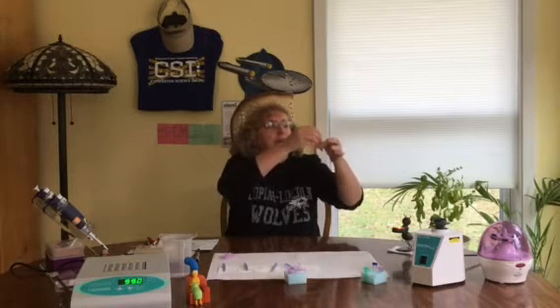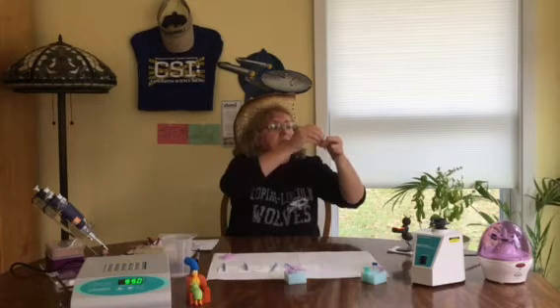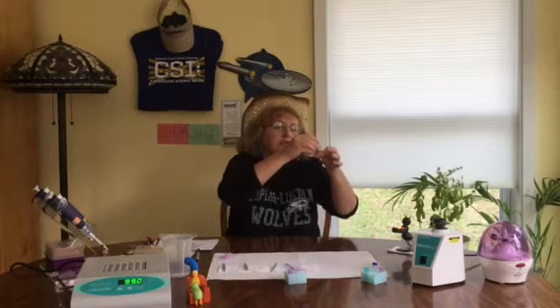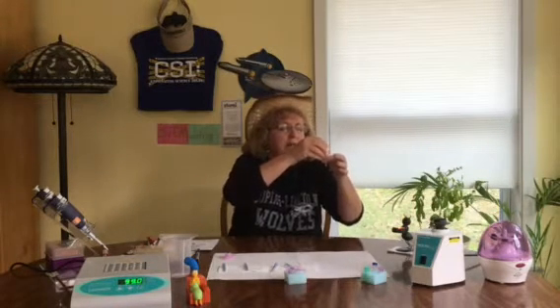Usually it's hard for students to know how much time they need to spend doing this. Well, roughly, I'd say maybe a minute, because sometimes the insects are tricky and it's hard to get a good grip on them. Usually you can tell if you've broken down tissue and done a good job with the exoskeleton. It should be in more than one piece. You may even see a white hemolymph, which just means that's the insides of the insect. So just do the best you can. Sometimes I cannot even tell you if you've done enough, but maybe for about a minute.